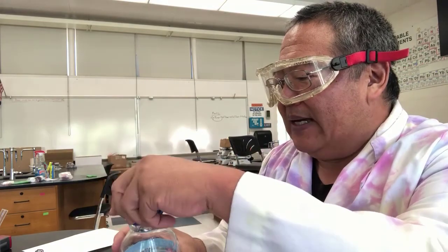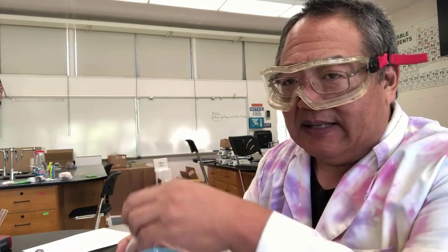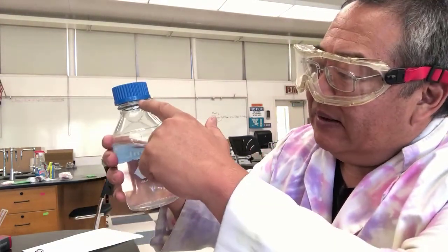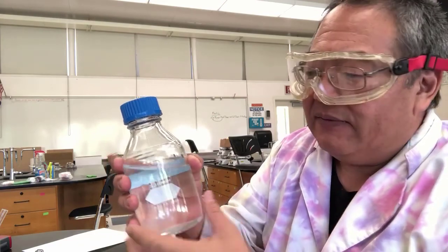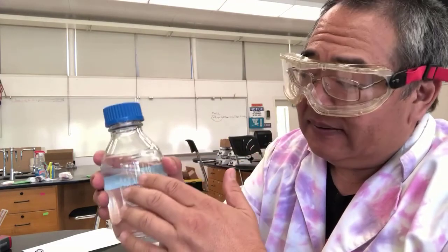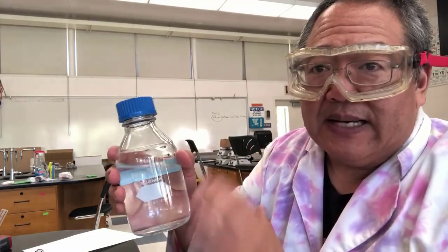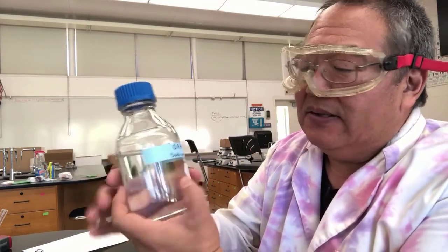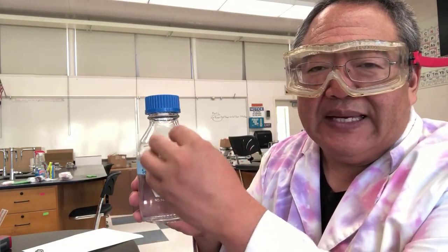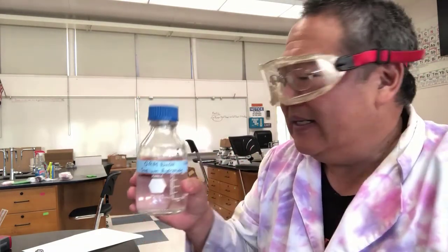Now, why do we do that? If everybody does that, let's say the liquid dribbles on the way out, like milk or anything like that, it dribbles as you pour it. Well, it'll be on this side. And if everybody grabs it from this side, then you'll never get it on your hand or your gloved hand, because it'll always be on this side. This side will be easy to clean. Also, this side has the information on it that you want to preserve for other people to see, so it won't be getting on top of this and erasing it, okay? So that's one of the things that I like to keep track of, a house rule.